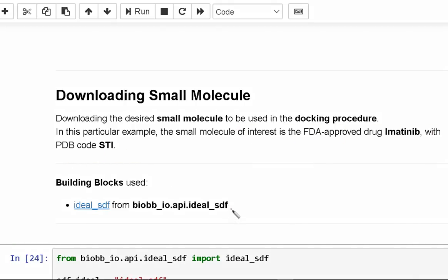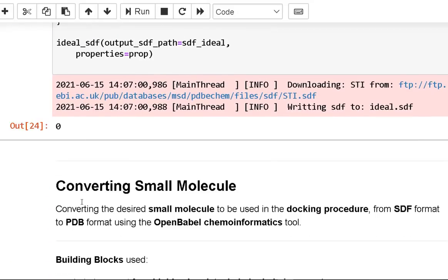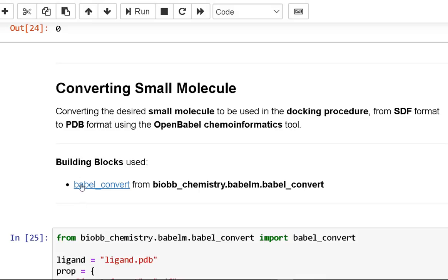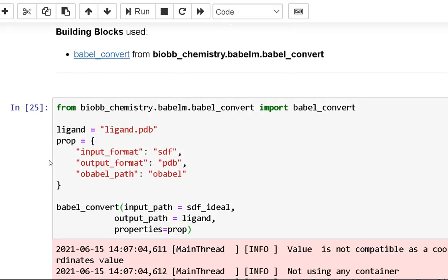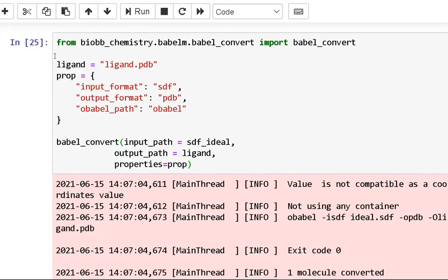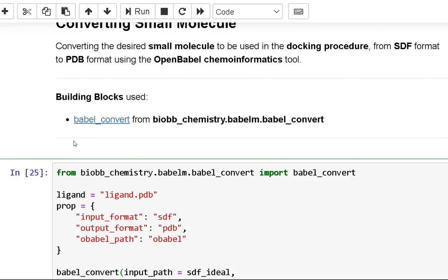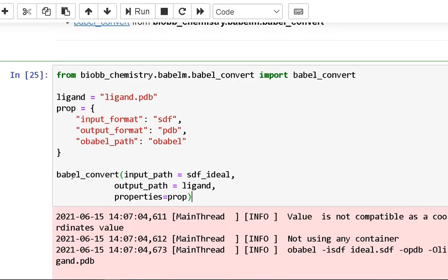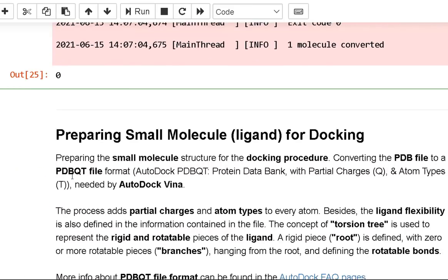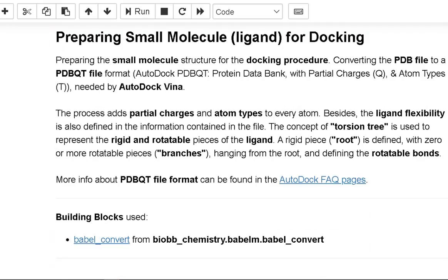For converting the small molecule, we use the Open Babel chemoinformatics tool to convert the relevant small molecule from SDF to PDB format, to be used in the docking technique.